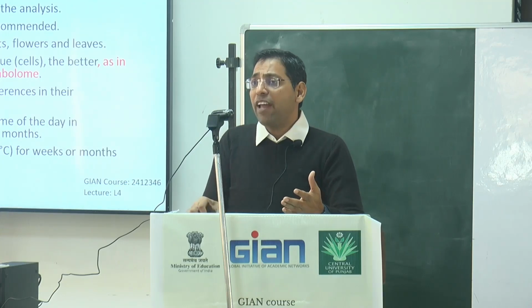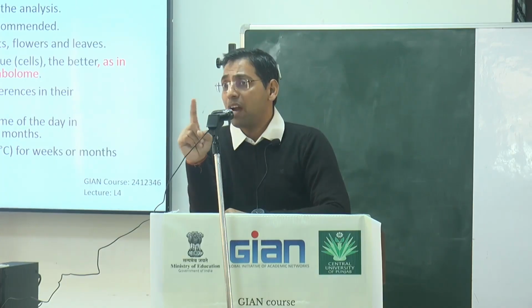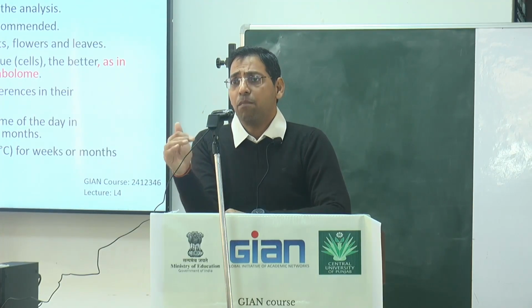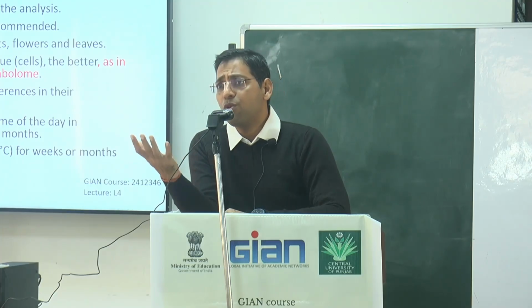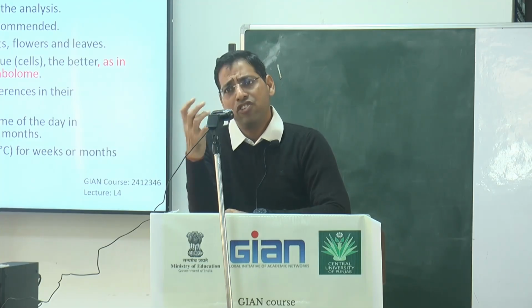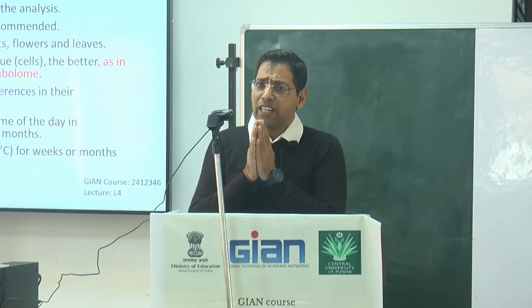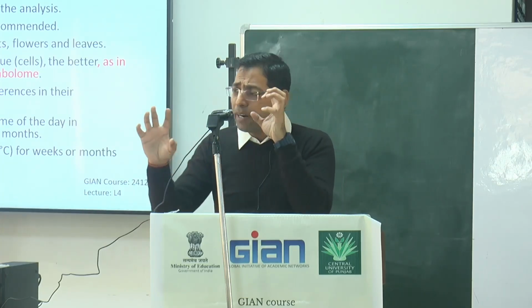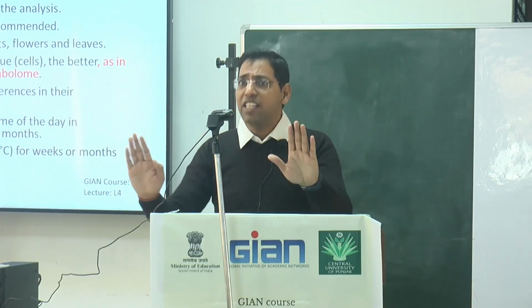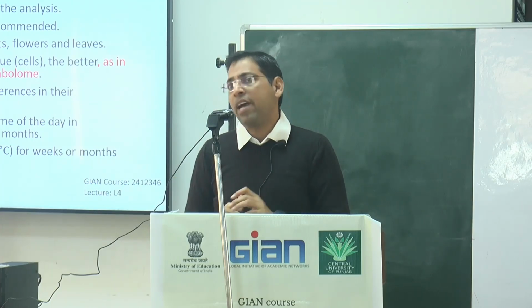When you cut the leaf, the leaf starts to respond, because the plant responds to change. When any situation changes, the plant changes its response, and that means the whole biochemistry of that plant changes. So you are capturing something different, a particular reaction, so you have to freeze the sample as early as possible when you take it from any plant.